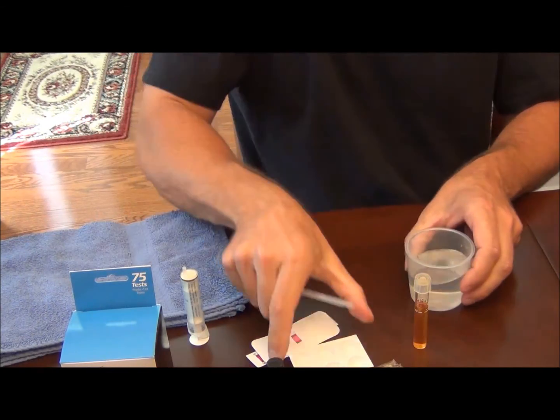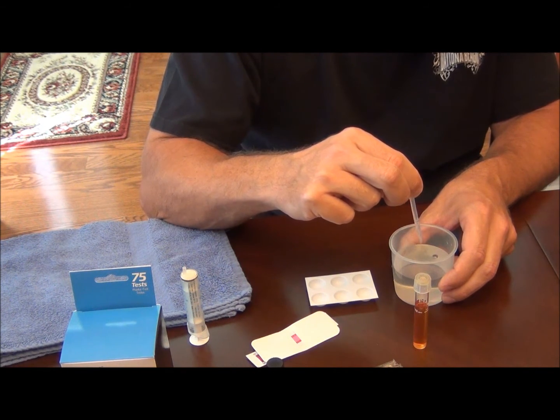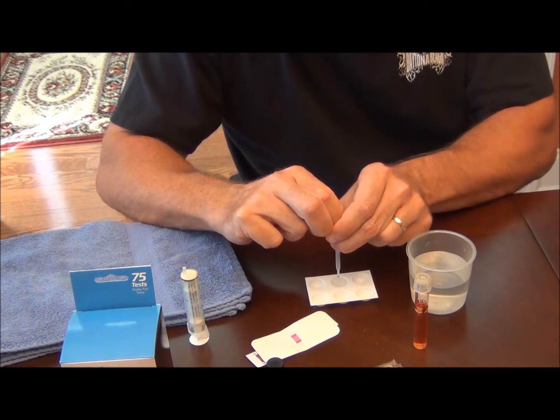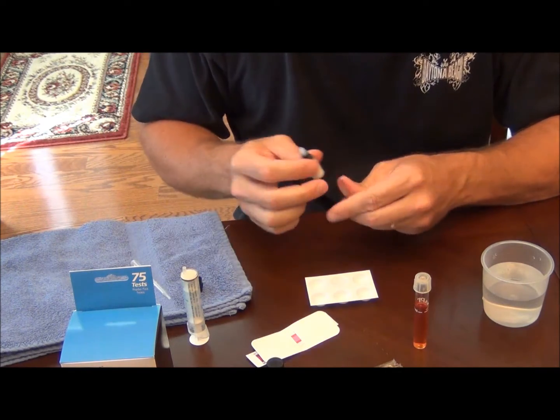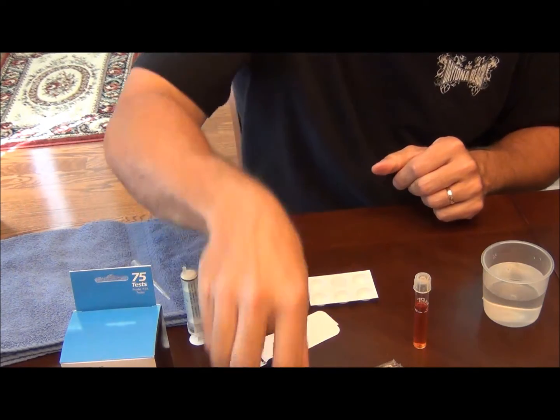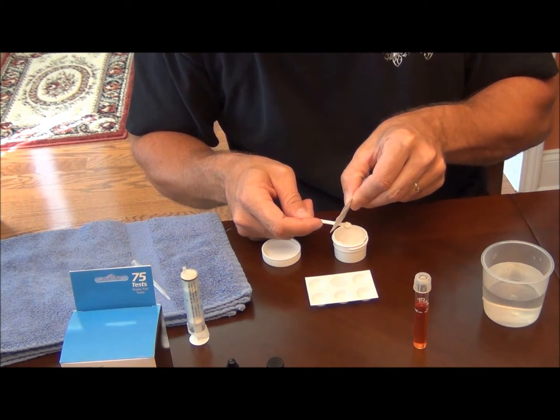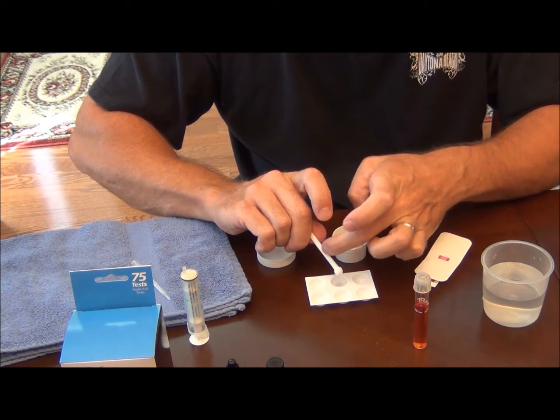Now I'm going to start Seachem's nitrate test kit. Fill the dropper to the base of the bulb. This is a more accurate test than API's. Fill one of these spots here in the tray. Now take one drop of the nitrite test solution — this is where you would stop if you were performing a nitrite test. But for the nitrate test you have to use one drop of nitrite and one level scoop of nitrate test solution. You don't want to pack the scoop, just get a level scoop of the powder. I'll take the card and rake it off flush, put that in there, and then stir.